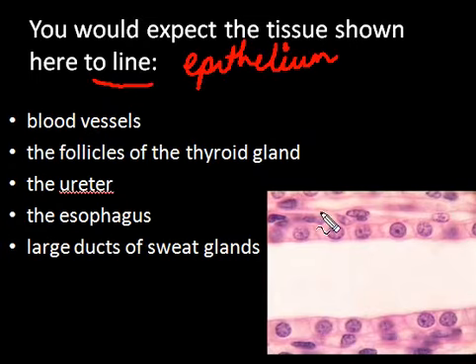Now whenever you're looking at epithelium, always identify the basement membrane first. And if you look at this thin line, here is the basement membrane, and this is an image which is taken from one of the sites you were asked to visit. So it's very important that you visit these sites frequently, because the only way you can identify images is constant exposure to these images. So please look at these images very, very often.